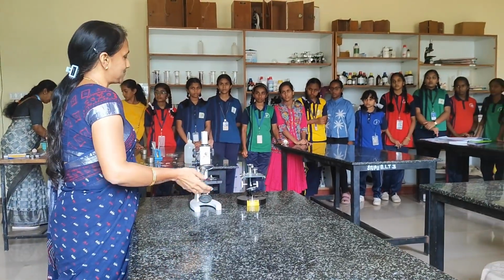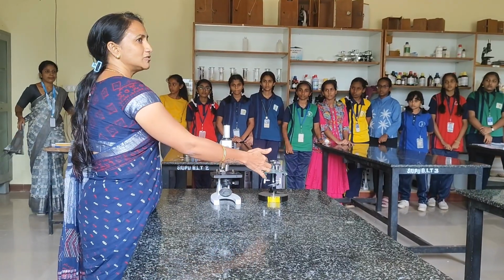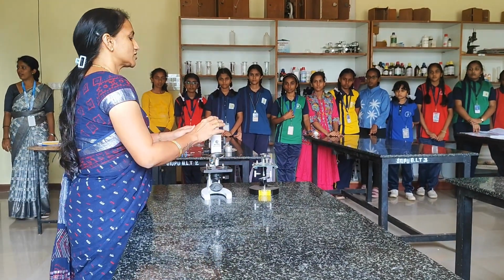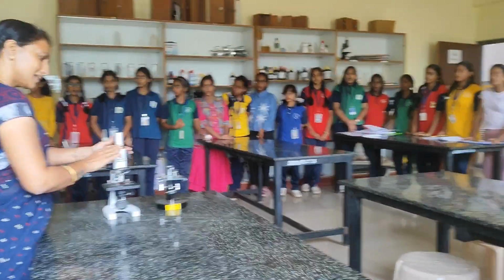There is also another type. So what is this, and this microscope? Do you all know the difference? This is called a simple microscope. Alright? And this is called a compound microscope. What is it called? Compound microscope.